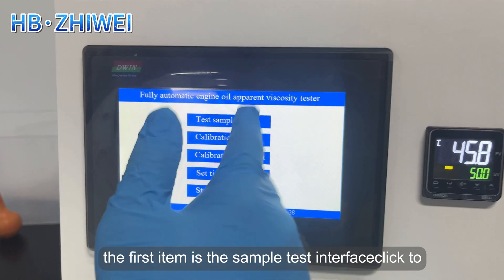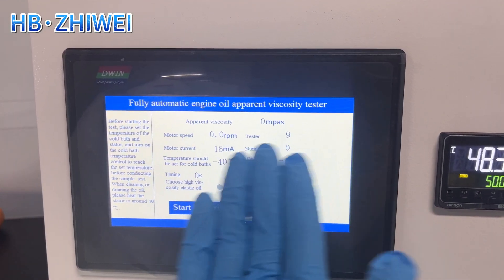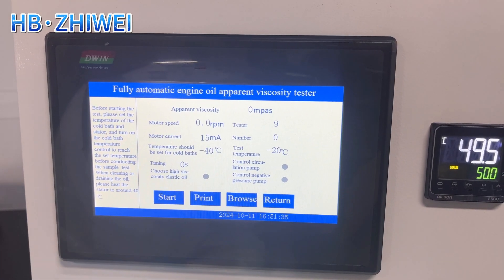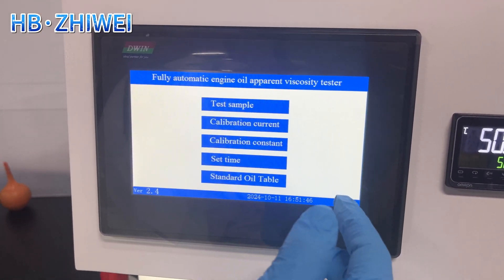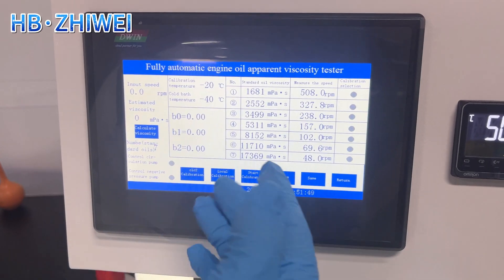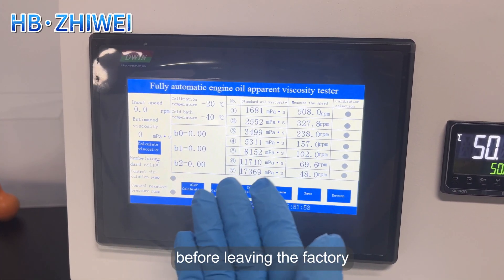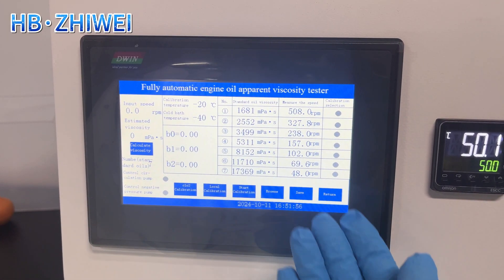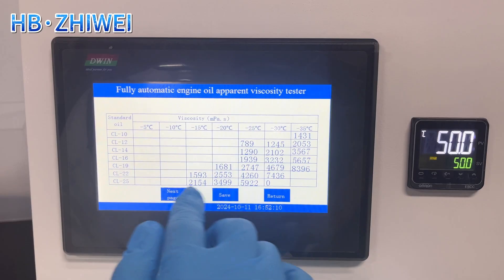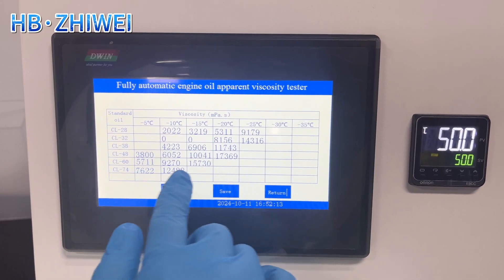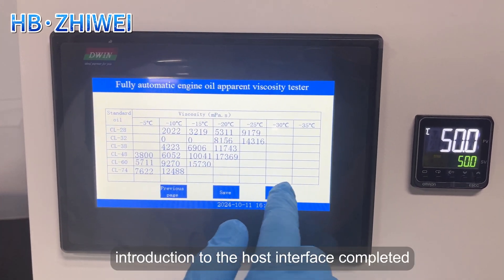The first item is the sample test interface — click to enter to set the sample parameters. The second item is current calibration — click to enter and set it according to the sample. The third item is constant calibration; the parameter calibration of standard oil has been set before leaving the factory, and customers should not change it at will. The fourth item is time setting, which can be modified by the customer. The fifth item is the standard oil table, which is only for storage and query — customers should not change it at will.